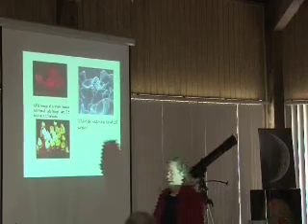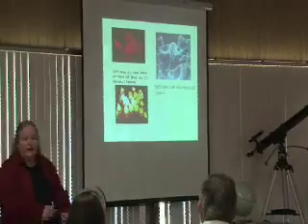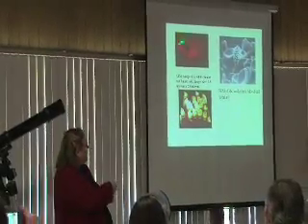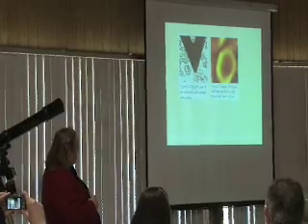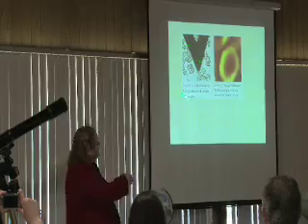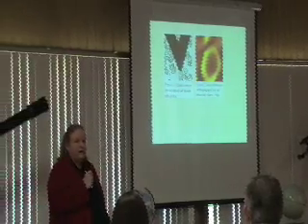Red blood cells, everybody has those. If you took your blood and put it on a glass slide and put it under an AFM, that's what they would look like. You see the individual blood cells with an AFM. And there's another view of a red blood cell. With an optical view, this is what you see. And with an AFM, you can really see the details of the shape of the red and white blood cells.